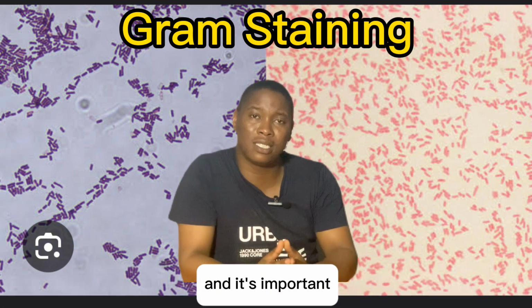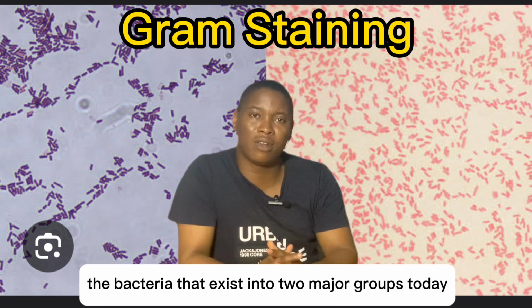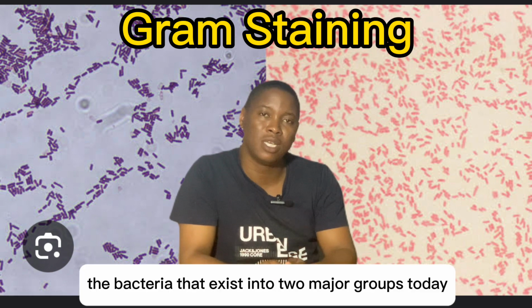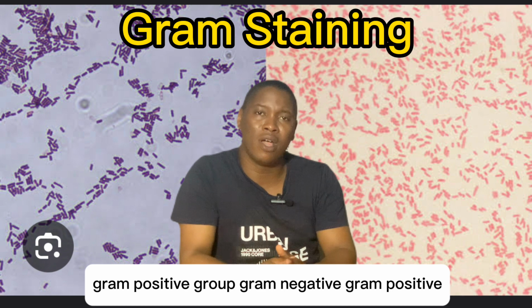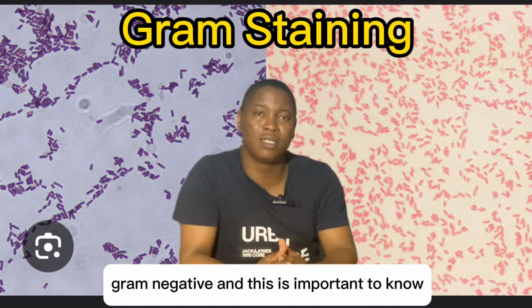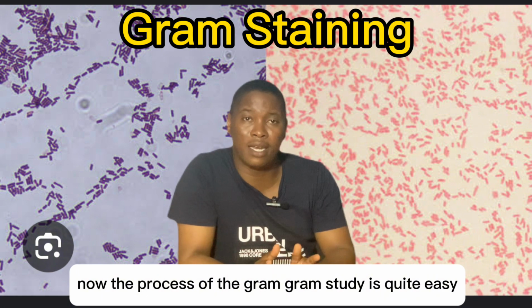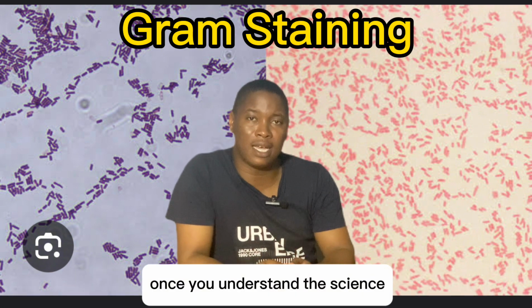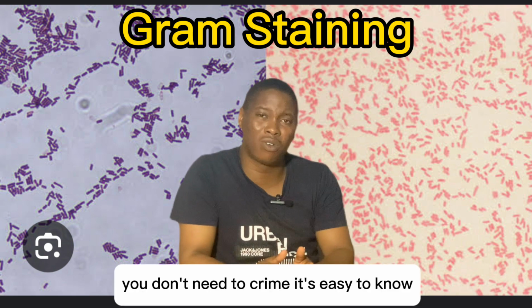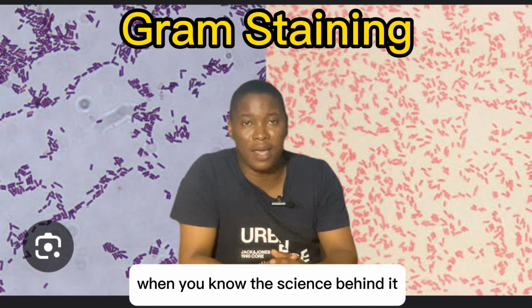It's important because it helps to divide most or all of the bacteria that exist into two major groups: either a gram positive group or a gram negative group. This is important to know. The process of gram staining is quite easy once you understand the science. You don't need to cram it. It's easy to understand when you know the science behind it.